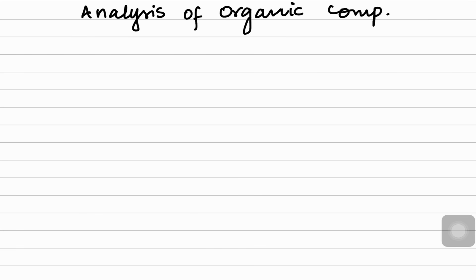Today's video I'm making in order to answer so many questions about a certain topic, and that's going to be analysis of organic compounds. So before we begin, we should understand that there are various functional groups that are tested using various chemicals, which includes carboxylic acids that look like this.